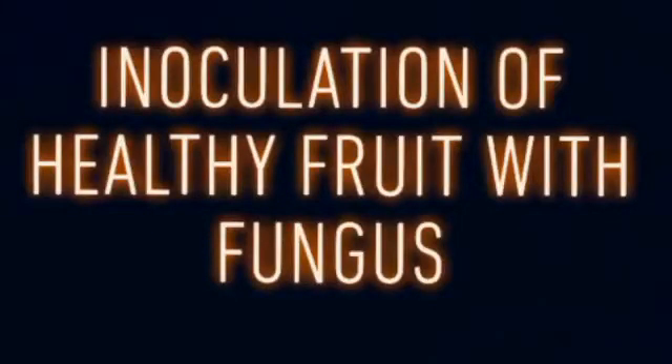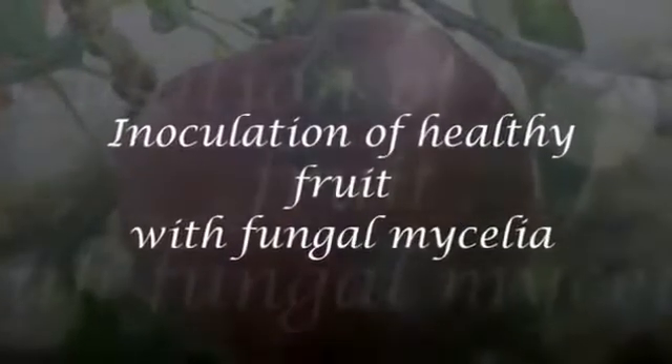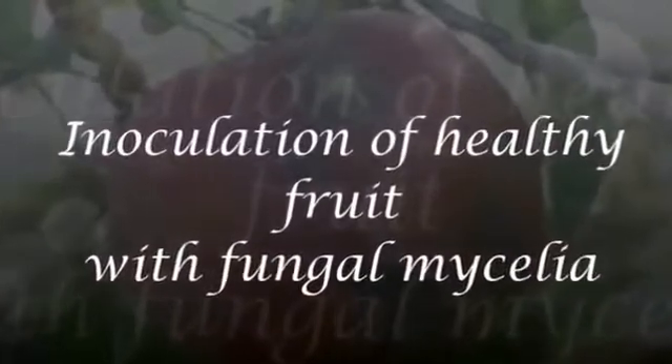Hi viewers, in this video we will demonstrate how to inoculate healthy fruit with fungus. The first method is inoculation of healthy fruit with fungal mycelia.